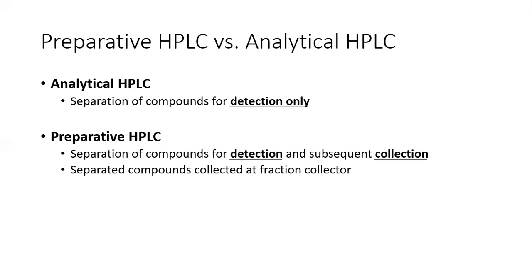Okay? So for our experiment, we're not really going to use the caffeine in your samples further. Okay, so itong preparative HPLC, usually, kaya kinokollect pa yung analyte nyo dahil kasi meron pang subsequent na analysis na gagawin. Okay, so usually pang ano to, mga method development. Okay? So analytical HPLC, this is usually for quantitative analysis.